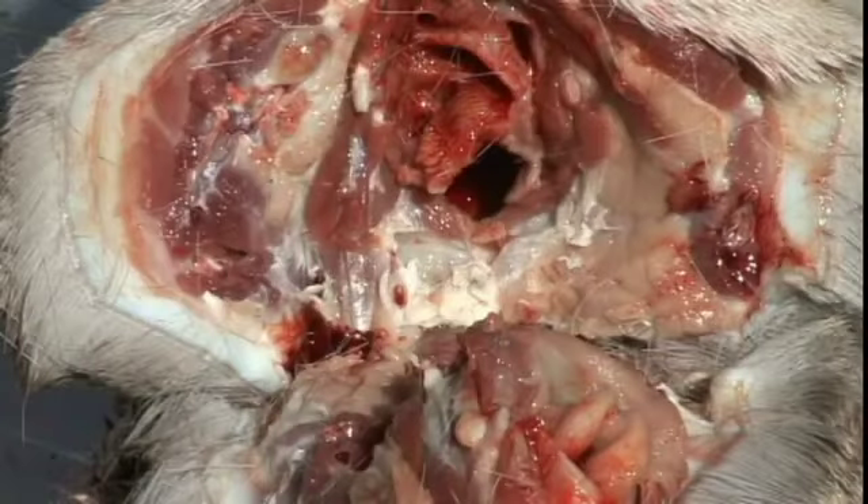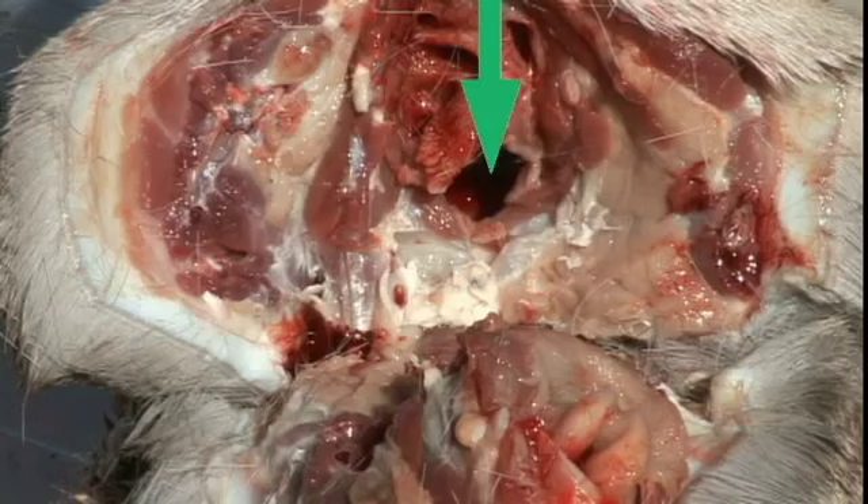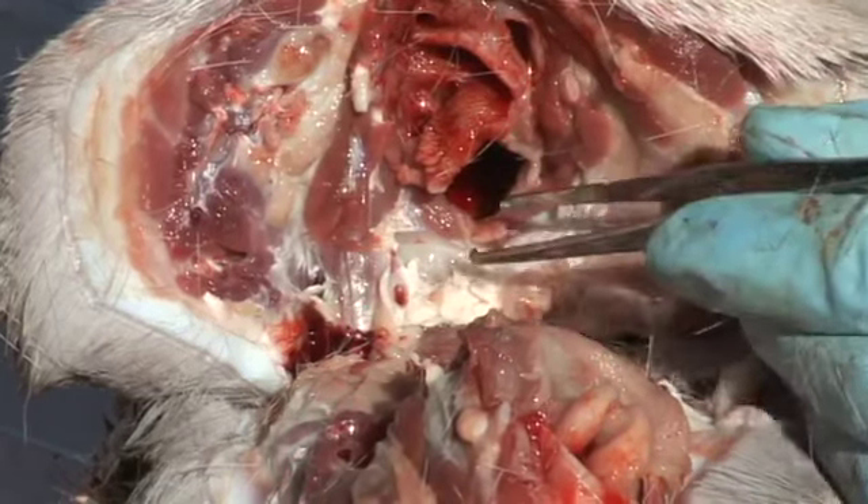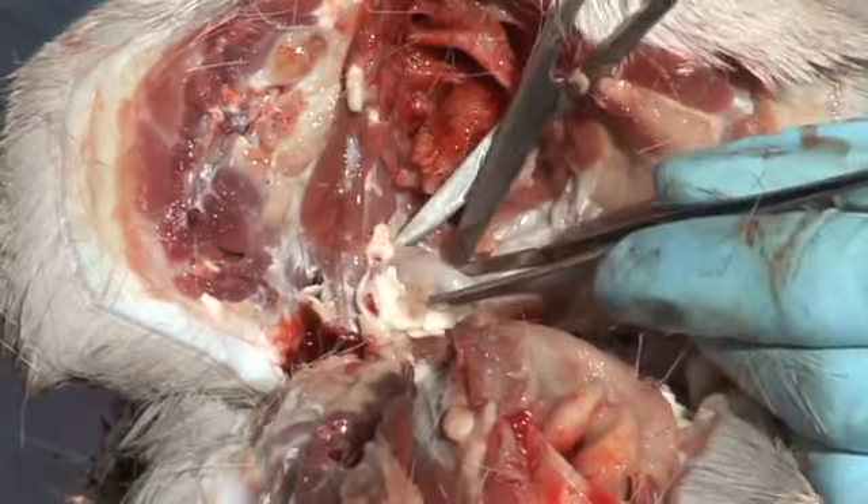The medial retropharyngeal lymph nodes are a pair of lymph nodes that lie near the base of the skull, just dorsal to the opening of the oropharynx. We will use the opening of the oropharynx as our landmark. The lymph nodes will lie at approximately 5 and 7 o'clock of this opening. Use forceps to grasp the lymph nodes and excise them with scissors or scalpel.